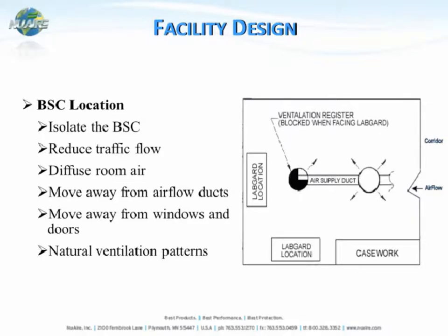Once HVAC is accounted for, you can look at where to locate the biological safety cabinet within the lab. Isolate the cabinet away from doorways and windows, and aim for low-traffic flow — you don't want to place it right by a door where people are walking in and out, as that could affect the performance of the cabinet. Also know where the ventilation registers are within the lab space so they are not blowing air directly at the biological safety cabinet.